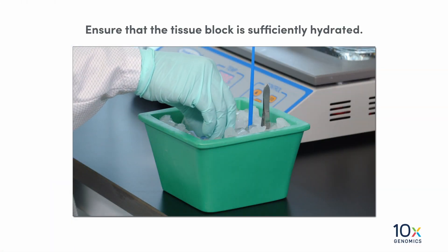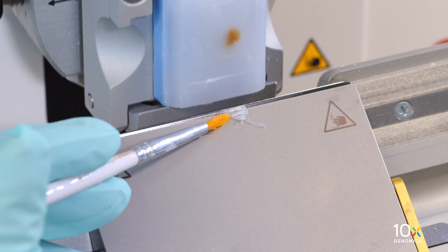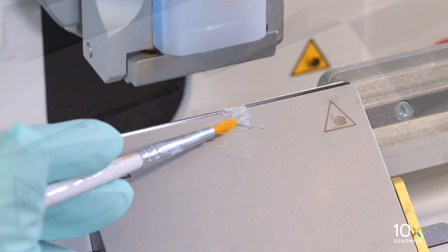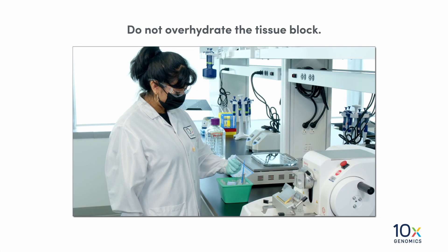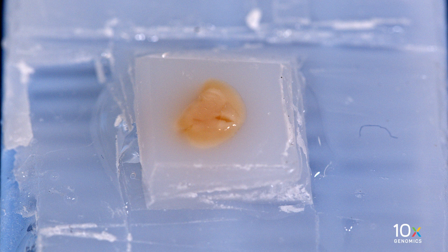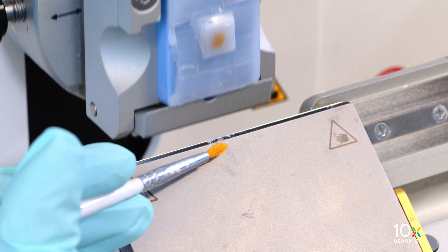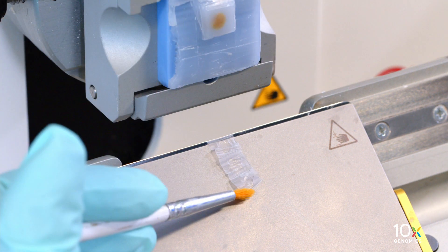Ensure that the tissue block is sufficiently hydrated. Tissue sections may shatter if the block is not well hydrated. Do not over-hydrate the tissue block. Over-hydrated sections will appear puffy, and if you attempt to section an over-hydrated block, the tissue sections may appear flaky and uneven.